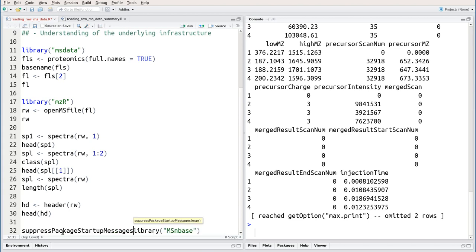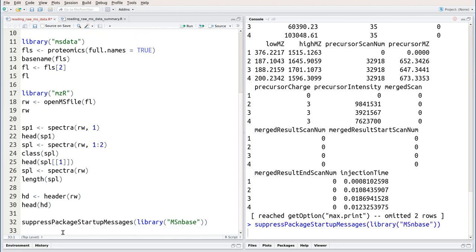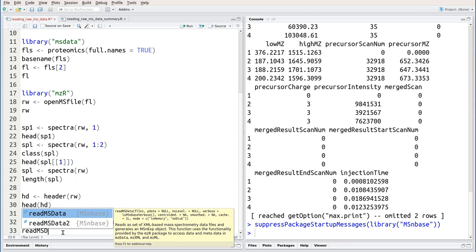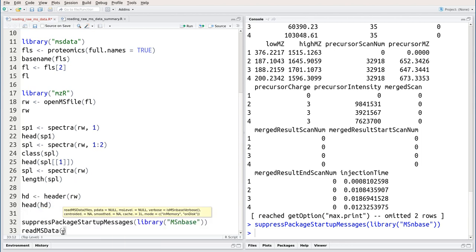Here I'm going to call the library function within suppressed package startup messages, because MSNBase has quite a few dependencies to suppress all these messages. Now instead of using OpenMS file from MZR, we're going to use the function readmsdata.